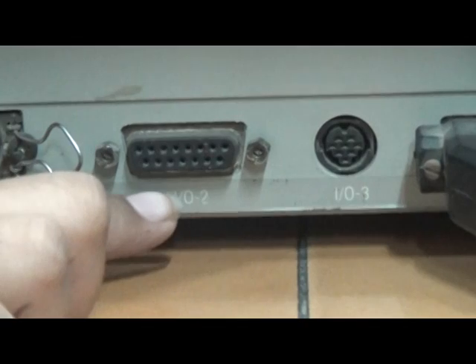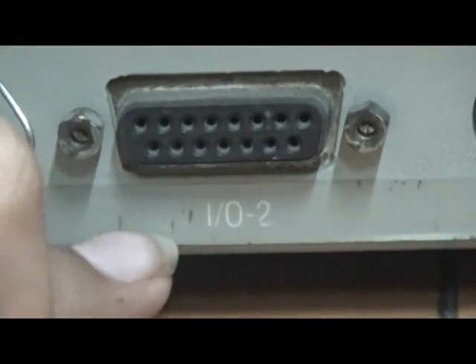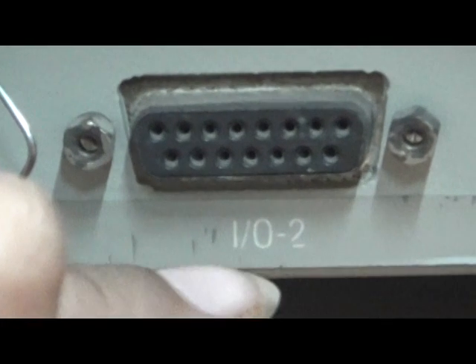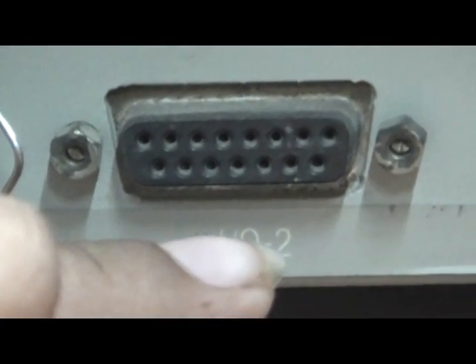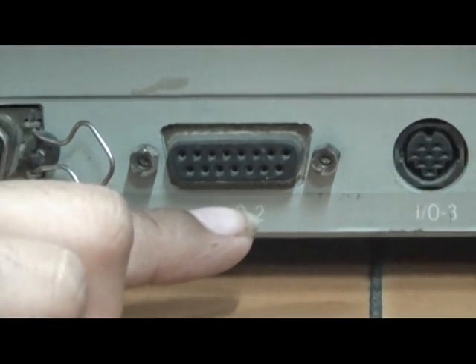Third one is the attachment connector, that is input output 2. This is the interface for connecting the optional sipper 160 or syringe sipper accessories.